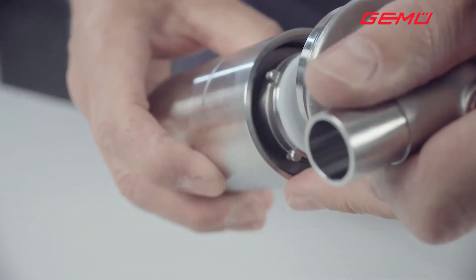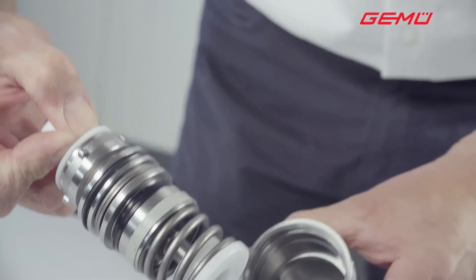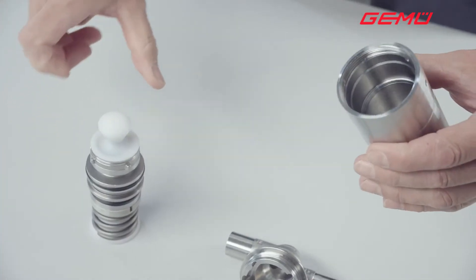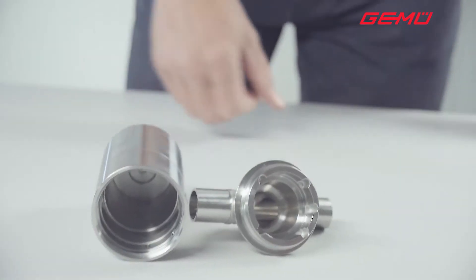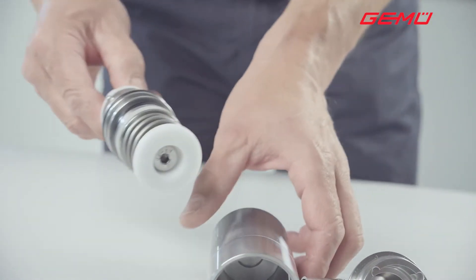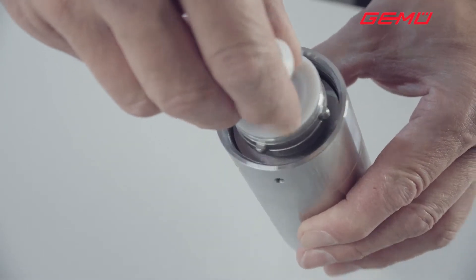Pull the used actuator cartridge out of the housing. Push the new actuator cartridge into the housing and press it in with both hands until it engages with a small click.